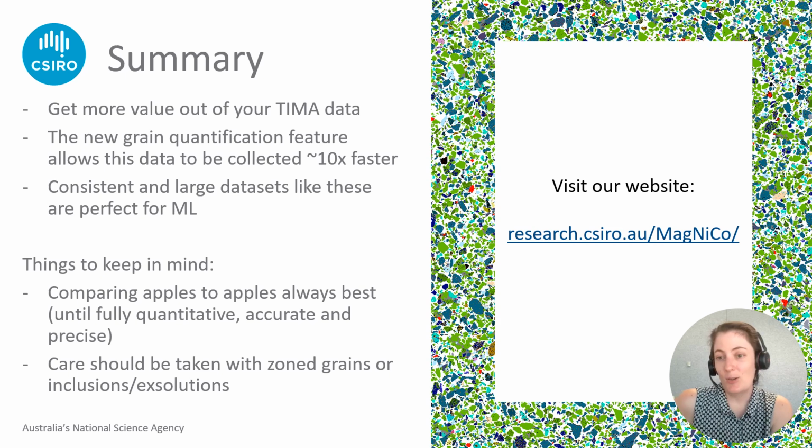So that's all I have to tell you about today. This is the summary of what I've talked about. So extracting mineral chemistry from your TIMA data gives you more value out of your TIMA data. So this doesn't require extra machine time. This is all in your data already and you can extract it very quickly. Then you have very large, robust, consistent data that you can use in machine learning models. This is about 10 times faster than it used to be, so I recommend giving it a go.